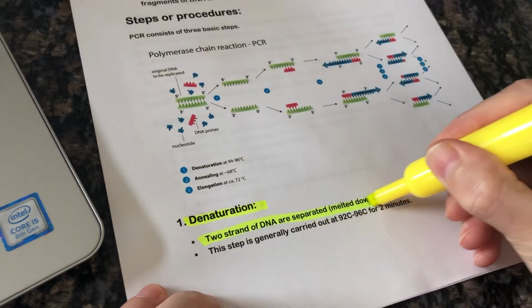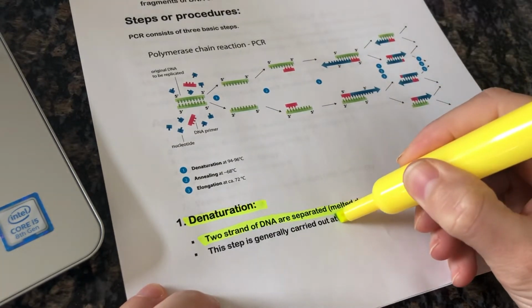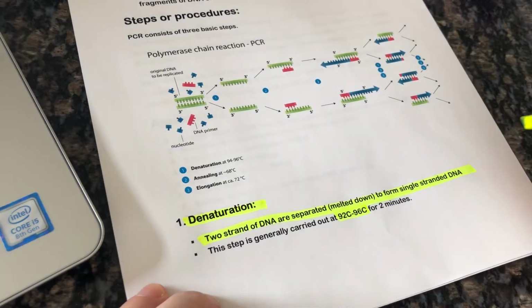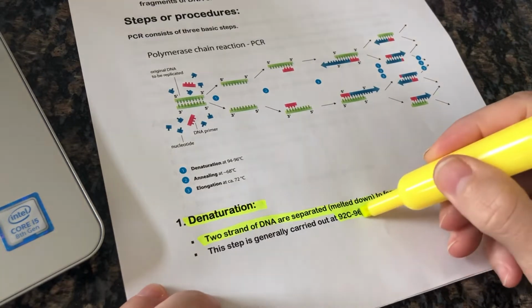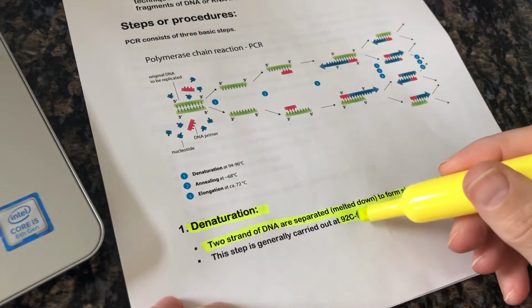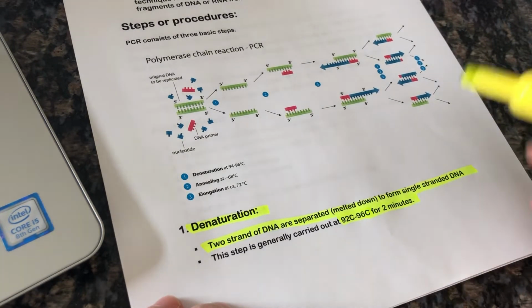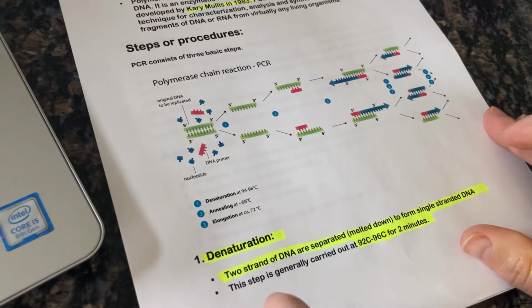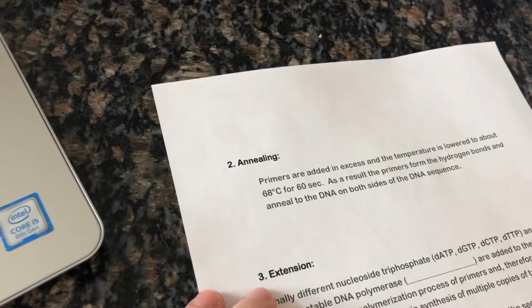Now, how do we denature this DNA? We have to melt it down. How do we do that? We bring it to temperatures between, depending on the machine, between 92 degrees Celsius and 96 degrees Celsius for 2 minutes. So think about that for a second. Think about your body temperature, okay? And think about other body temperatures of different organisms. That's quite high, all right? So this is Celsius, not Fahrenheit. So this is a very high temperature. So they put the DNA in very high temperatures, okay? And they denature it.